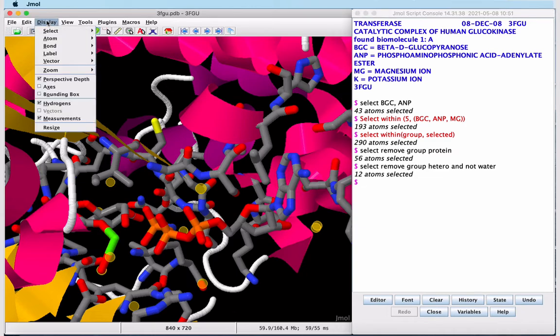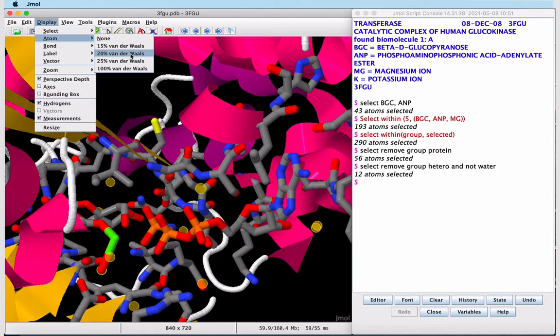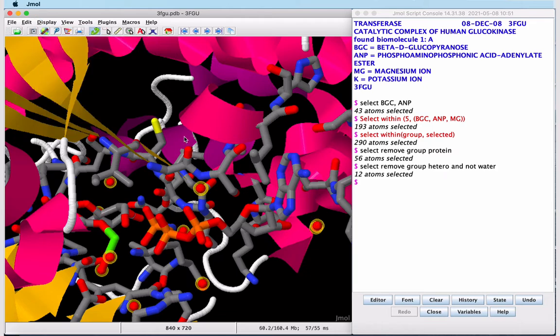Using the display drop-down menu, I can show these atoms at 20% of Van der Waals radius. And there are our active site water molecules.